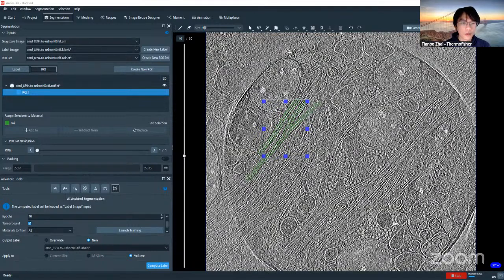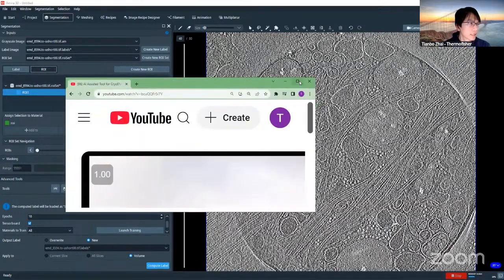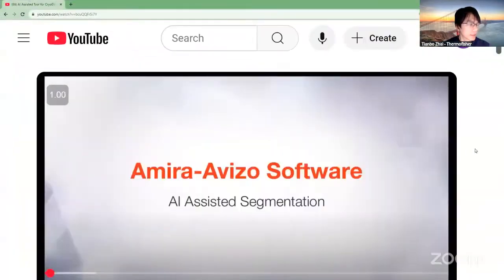So essentially, this is how it could look after you did more annotation, placed a few more ROI sets, and performed training incrementally from small epochs, then increased from there. So this is, again, one of those expected results.